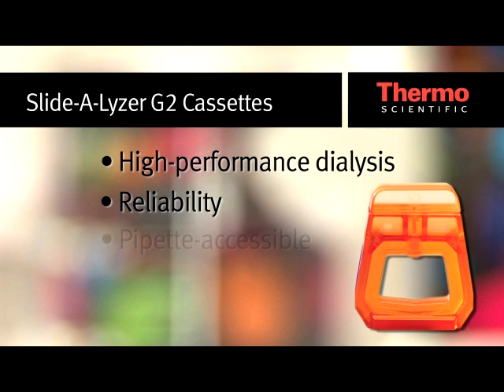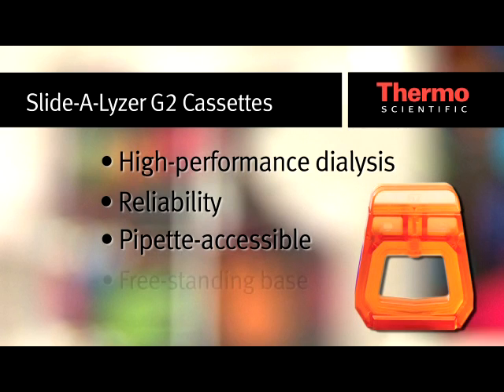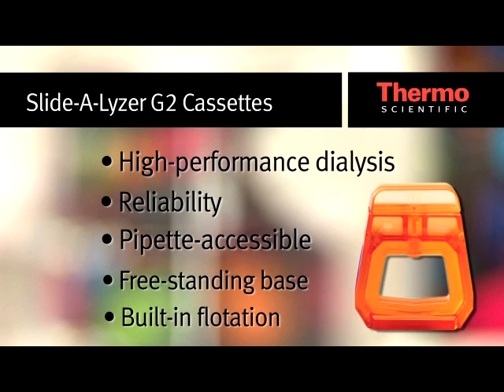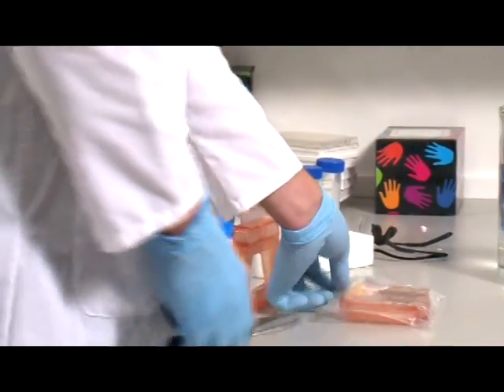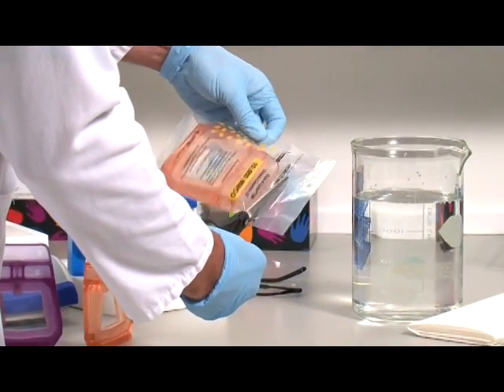With the added convenience of a pipette-accessible sample port, freestanding base, and built-in flotation. Watch how easy it is to use the Slide-A-Lyzer G2 cassettes.